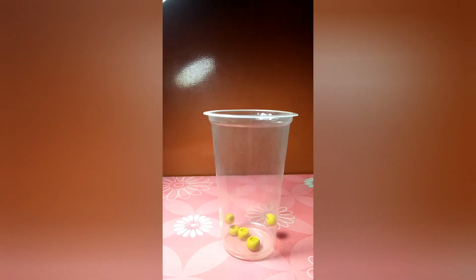So, there are different types of ELISA. For example, first one, direct ELISA. Here what happens, this is a well. We are not looking at the whole microtiter plate. You can see here the yellow particles. These yellow particles are antigen. The antigen is immobilized to the surface of the multi-well plate, meaning they are coated to adhere the particular type of antibody. Now, when we add the serum sample to the well, antibody specific for the antigen and directly conjugated to detection molecules such as HRP, as we talked earlier, binds to the antigen and gives the result.